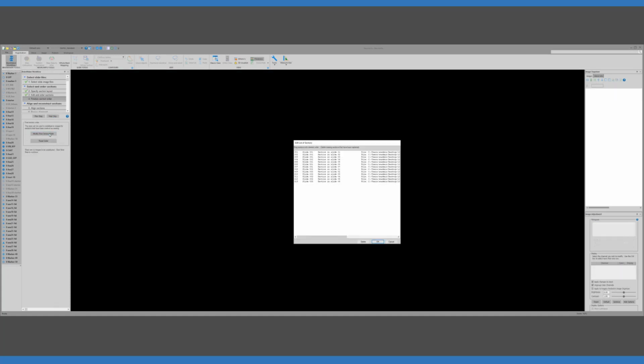So in this simple example, this puts all of the sections that have been ordered in their order. So this is the first from that series through 13. Sometimes mistakes might be made, and so you have to adjust the order of that.